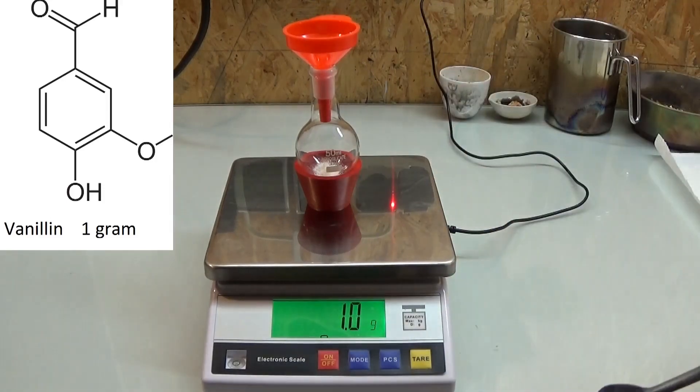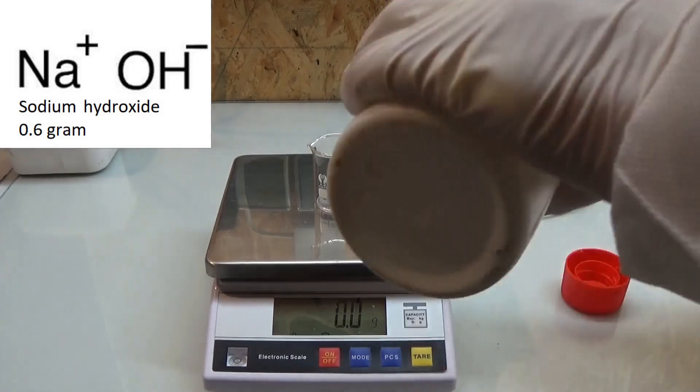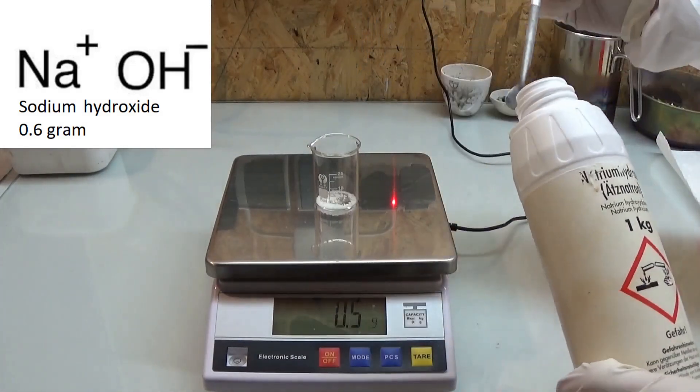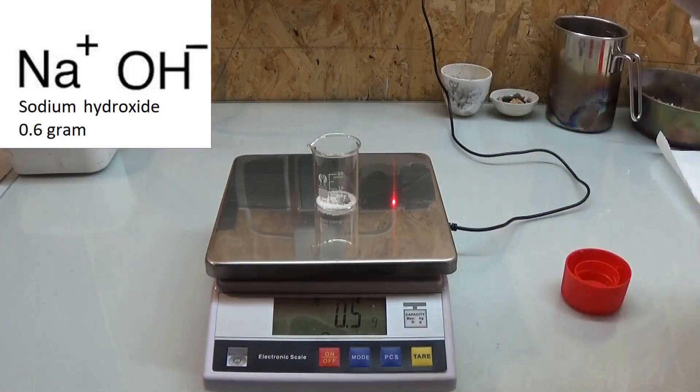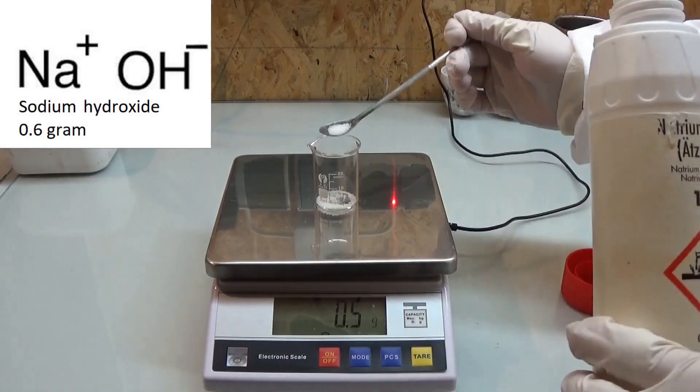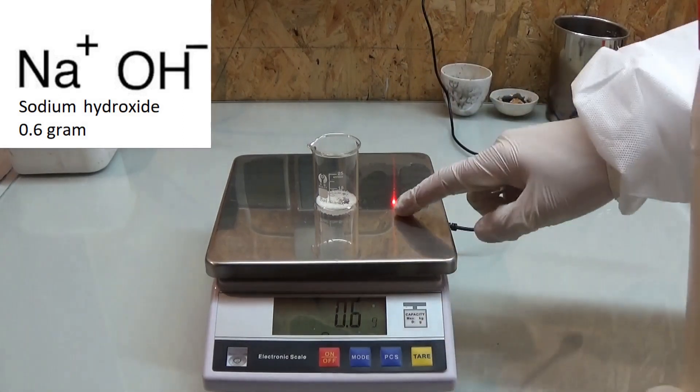To begin I weigh out 1 gram of pure food grade vanillin followed by 0.6 grams of sodium hydroxide which acts as our catalyst and forms the alkoxide from vanillin.